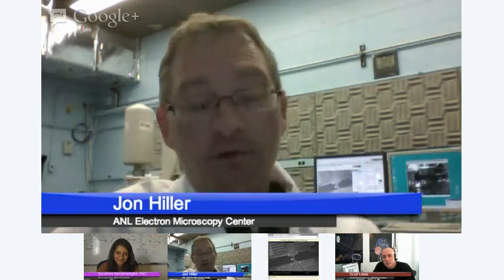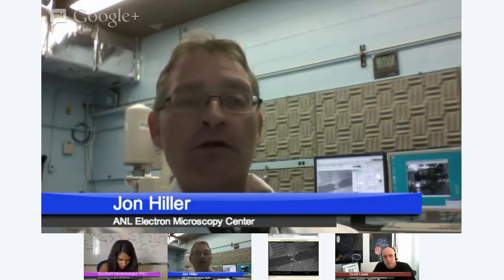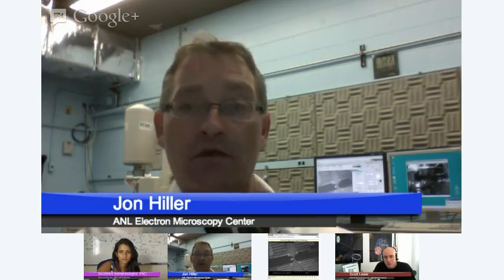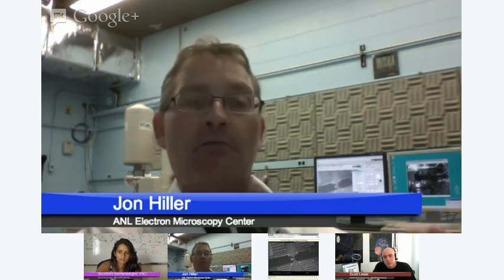One electron will interact with an atom on the surface of the sample, and the atom on the sample can eject its electron. Those are called secondary electrons. And so it is representative of the sample. And each atom of the sample has electrons that float around, and we can detect those using different types of detectors and different processing of that signal, which relates to an image. So basically, we are detecting electrons from the sample, which are secondary electrons.